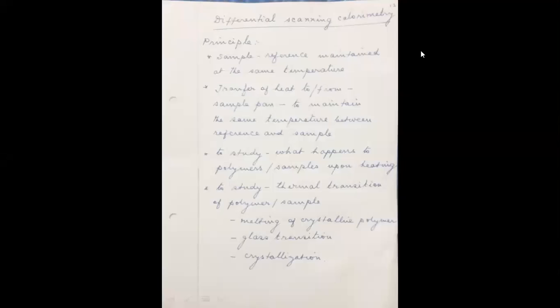So, differential scanning calorimetry. Watch closely. This is a little bit difficult to understand because we are not familiar with differential scanning calorimetry. Here we have two substances. One is the test sample, and the other is a reference substance.